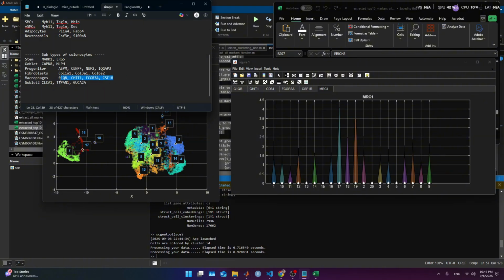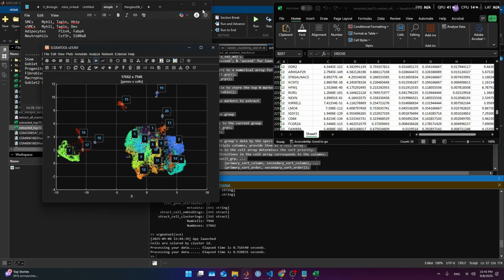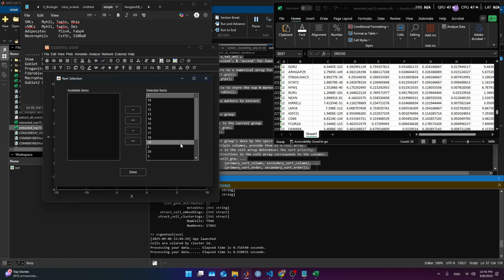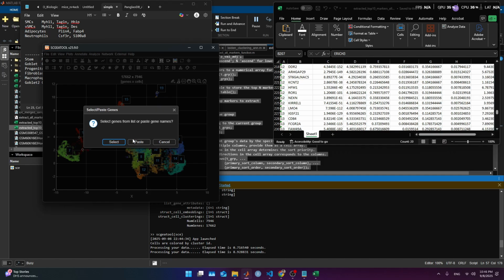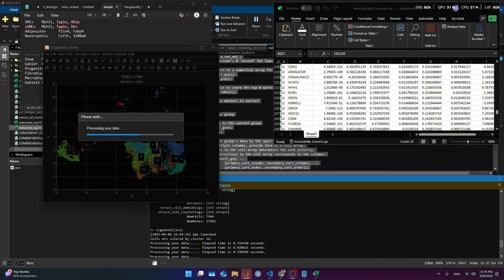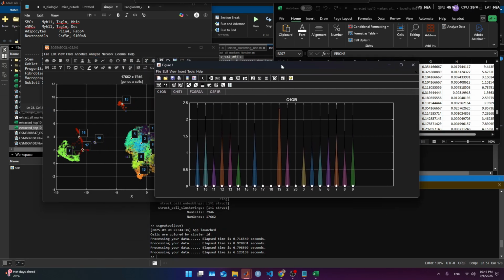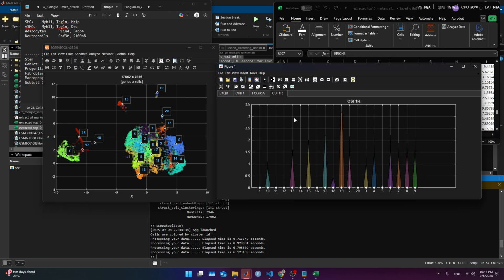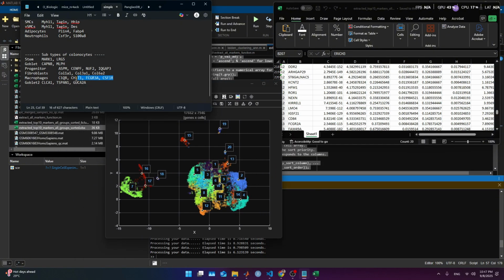So if we do this again, I'm going to close it and do again the Violin plots per cluster ID for all the clusters, genes, and copy paste A and B. I can stop. Oh, I didn't have to. I'm just going to wait. It's not going to take that much. And we get it. Again, this is one, this is the second. Okay, great. Everything is lighting up properly. So now we have a way better curated macrophage.